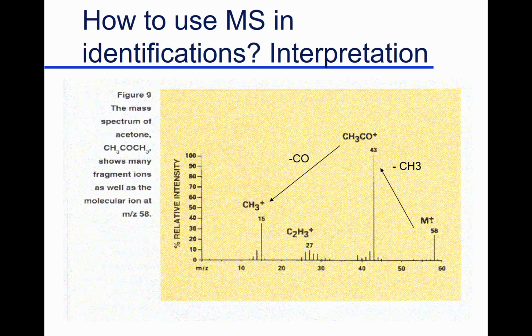Ted, you ever see stuff come through with a C13, going off from what you'd expect? You will always see the normal C13 distribution. If you get a 78, you get a 79 as a small 1% peak, and it comes from C13 isotopes.